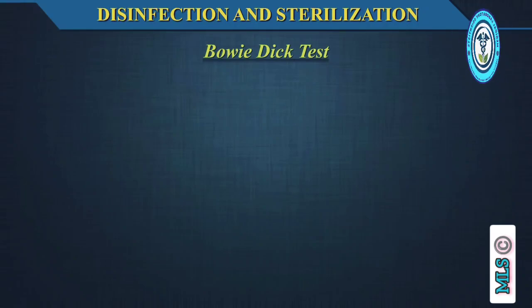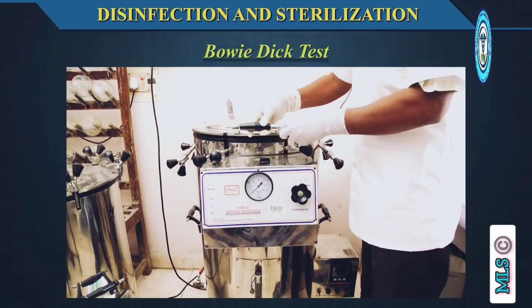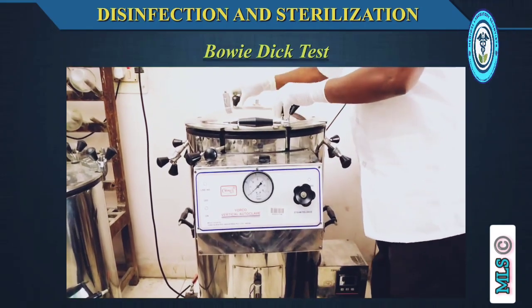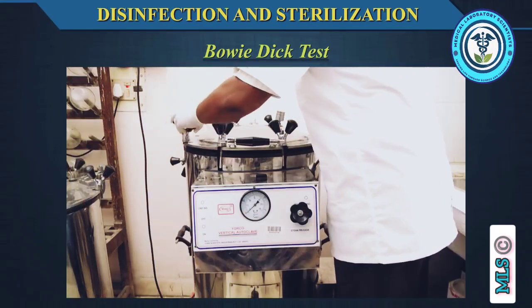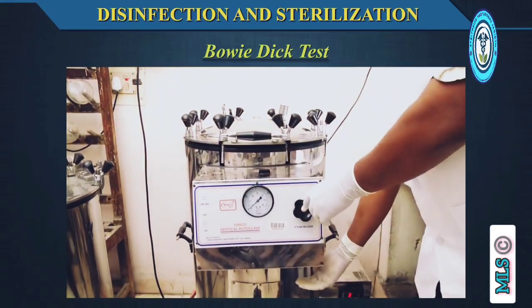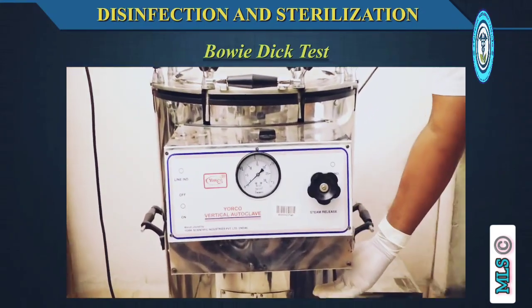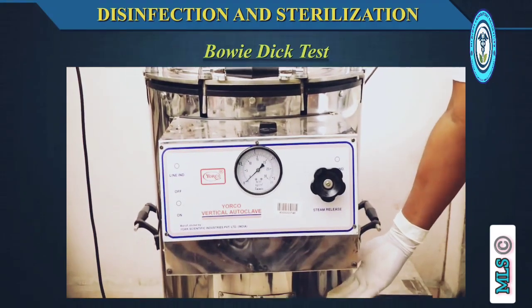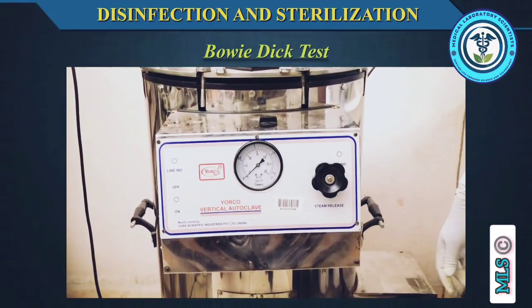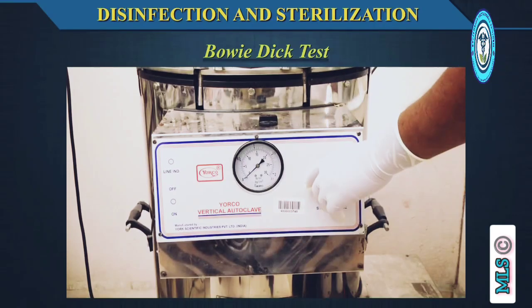Bowie-Dick test. It demonstrates even and rapid penetration of steam in a steam sterilizer or autoclave. If air and non-condensable gases are not removed from the chamber and the load or from the steam supply, they may become trapped within the load. This would prevent penetration of that part of the load by steam, and consequently, sterilizing conditions may not be obtained.